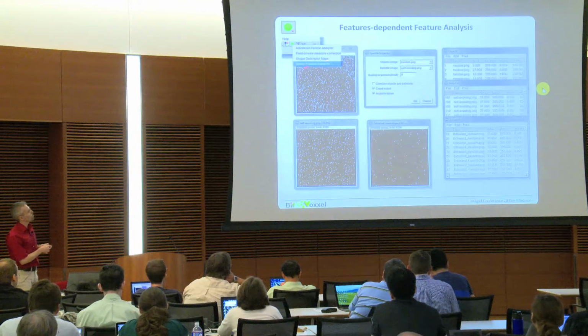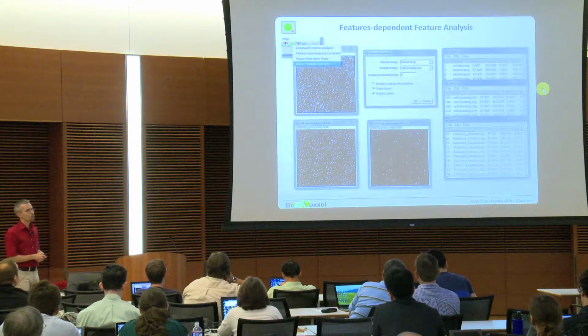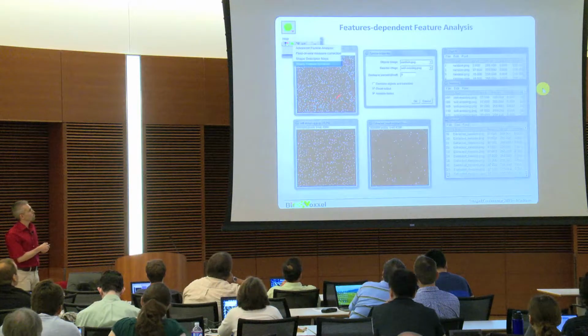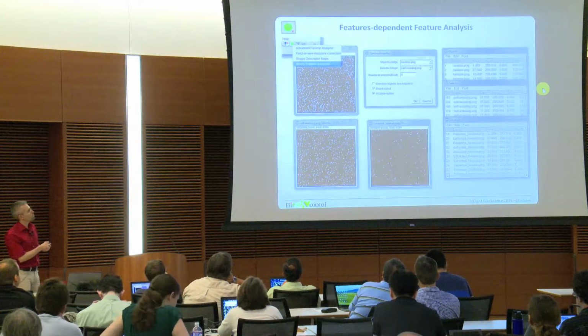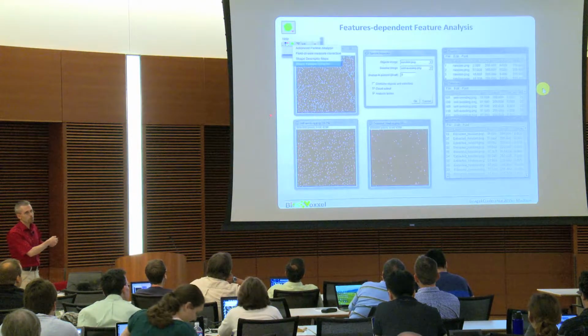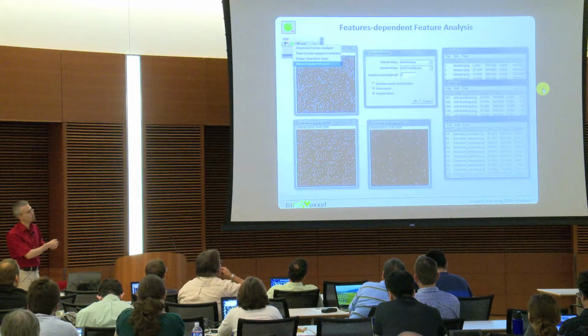So therefore we have the binary feature extractor, so you can use that also to get directly an analysis of the objects, but that is rather seldom the case that you need that. But we can separate them, so you have an object image and you have a selector image, and the selector image decides which objects are kept in the final image if they have a certain overlap.